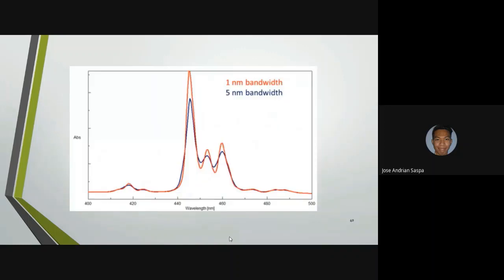In this picture, as you see, all molecules absorb and emit light differently. It depends on the types of covalent bonds available in molecules. If the reactants and products interact with light differently and there is a color change as the reaction occurs, we can monitor the process using a spectrophotometer.